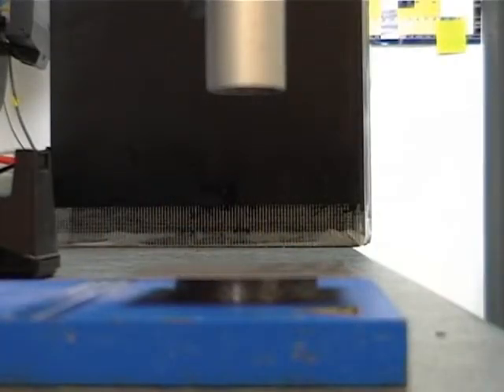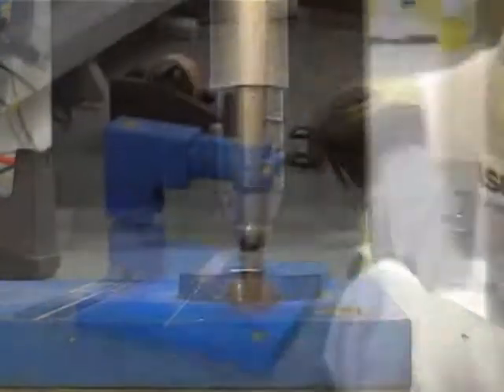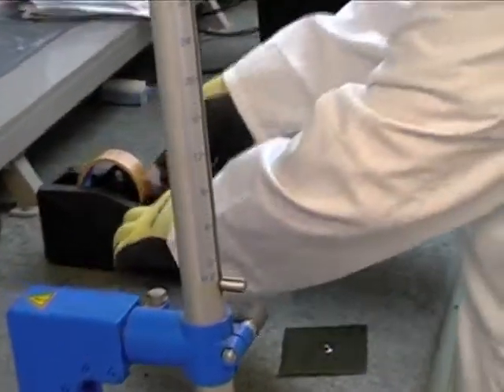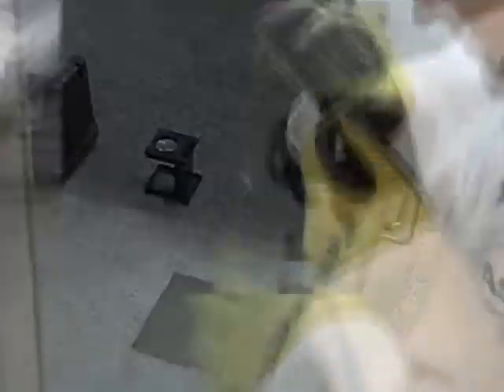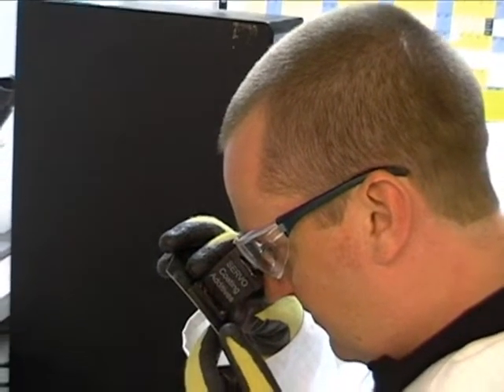Once the indentation has been formed, the surface is inspected for any signs of cracking or loss of adhesion between the paint and the substrate. Self-adhesive tape is first applied and removed to enhance the visibility of any damage, and the sample is inspected using a magnifier.